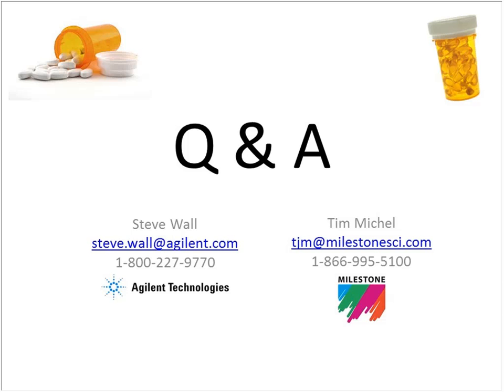Thanks, Tim. I'll just go over a couple of questions here real quick that came in during the presentation. Some of these had already been addressed, but I guess they just wanted some clarification. So number one question was, when is ICH Step 4 announced? The latest we have on that is from the meeting report notes from the most recent ICH meeting, which took place in June in Minneapolis. The notes said, and this is a quote, it's expected that Q3D guidelines will reach Step 4 by the end of September 2014. So expected to happen anytime, so stay tuned for that. We're all anxiously awaiting that.